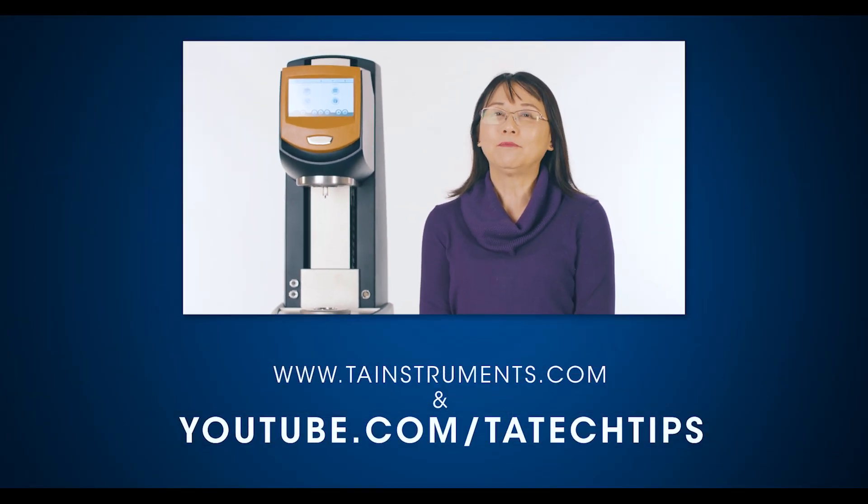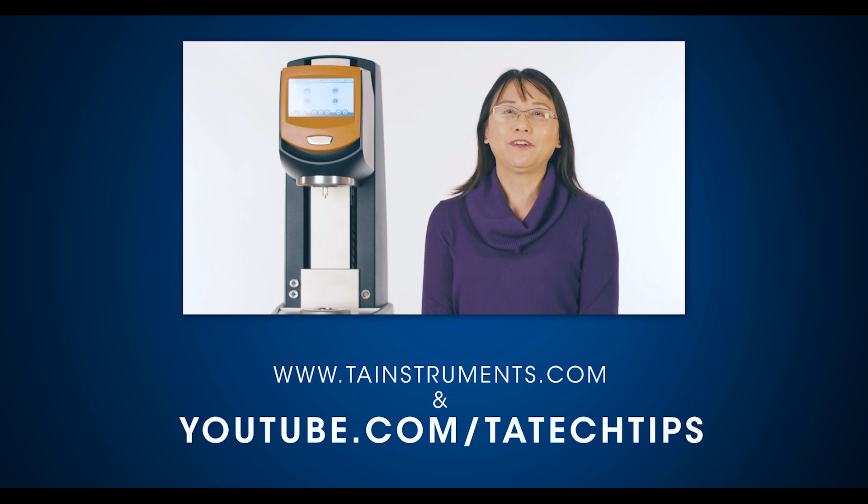In this TA Tech Tip, we have learned how to load a liquid or soft semi-solid sample using either the instrument touch screen or TRIO software. We also discussed proper sample loading volume and techniques for successful edge trimming. Please stay tuned for more helpful TA Tech Tips, and thank you for your interest.